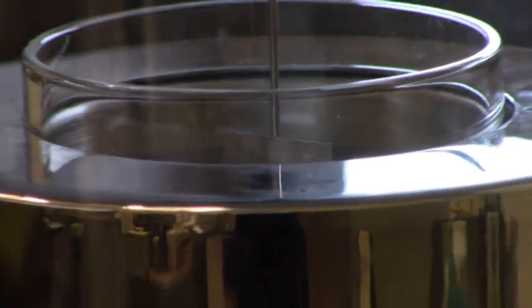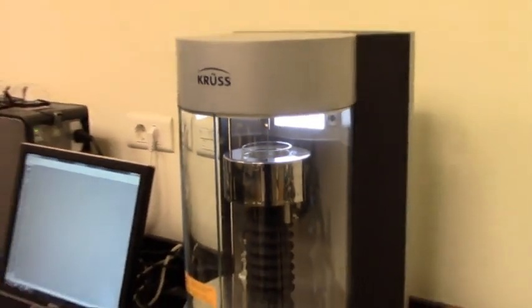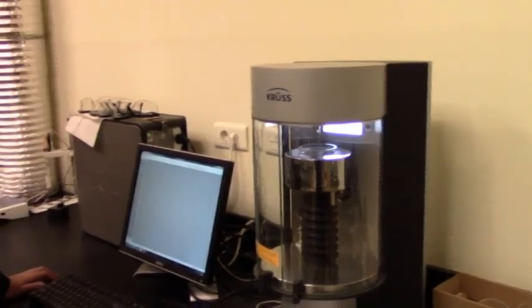So this is the software. It's got two parts. This red part for surface and interfacial tension, and this green one for the contact angle. We use this later. So let's start with this one.